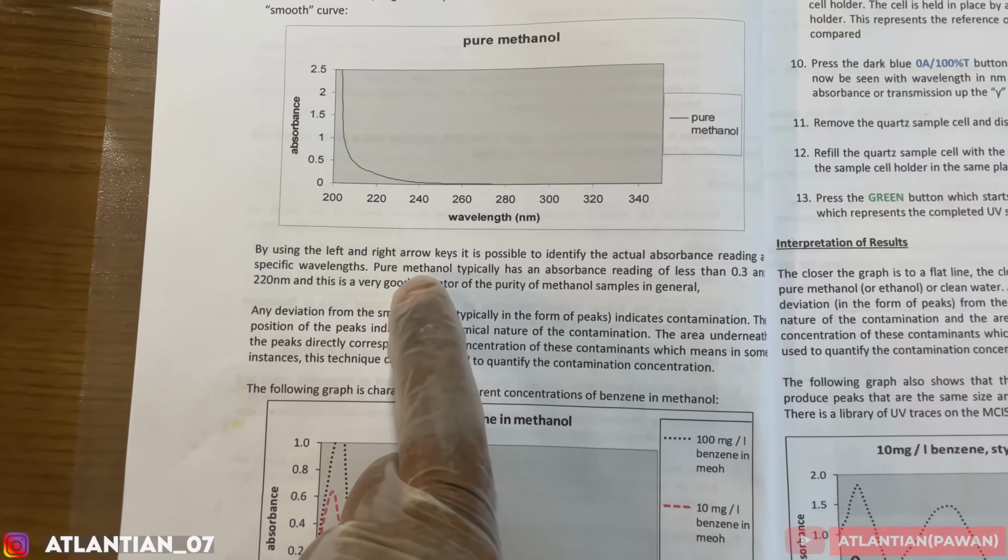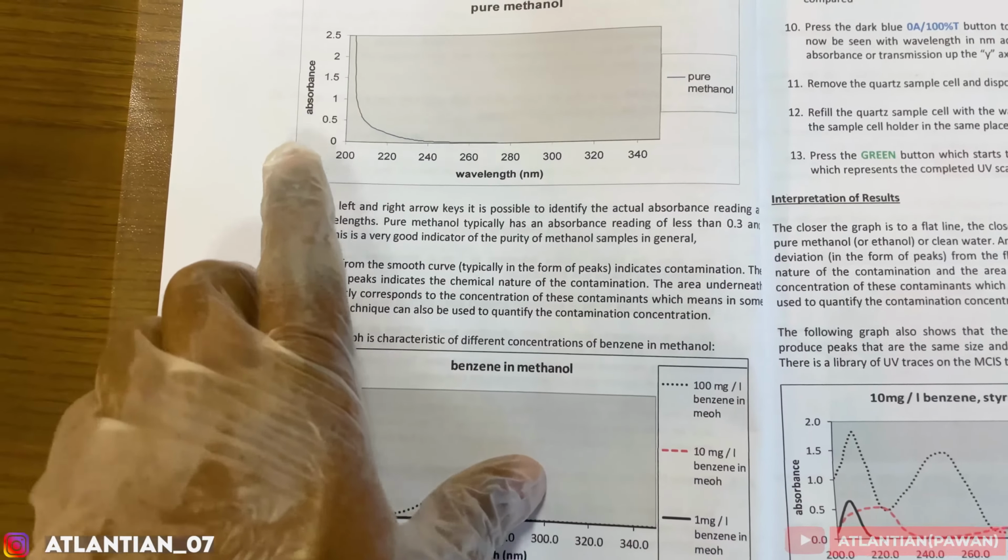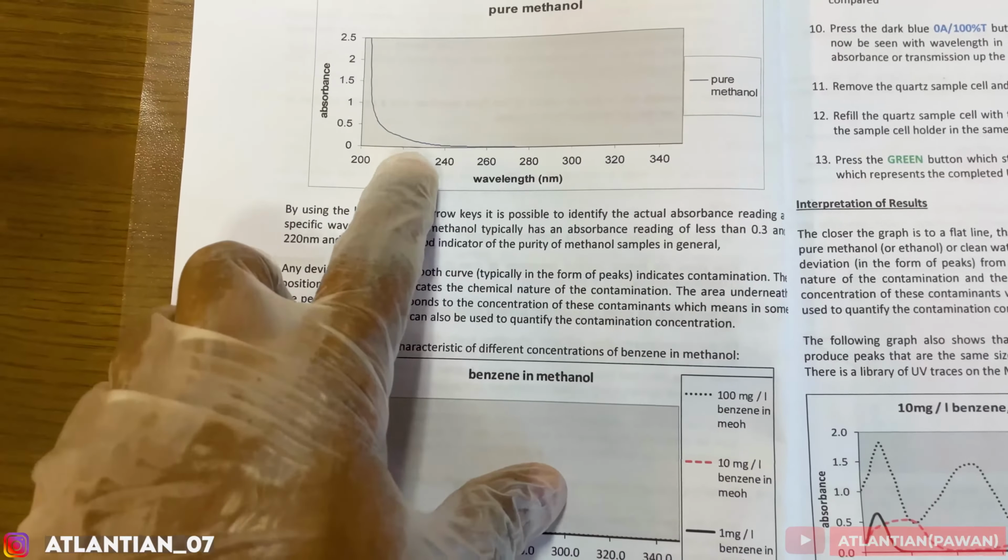That is a good indicator of the purity of methanol. This is for methanol and we are reading for M.E.G., so those readings are almost to be similar. So in this case also we'll check at 220 wavelength that our reading shall be less than 0.3.